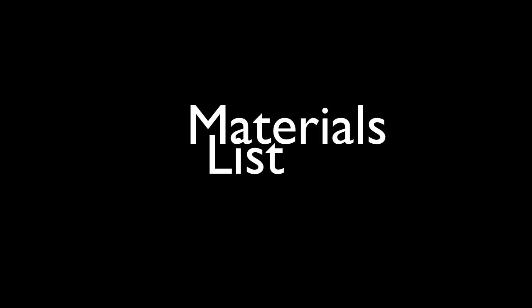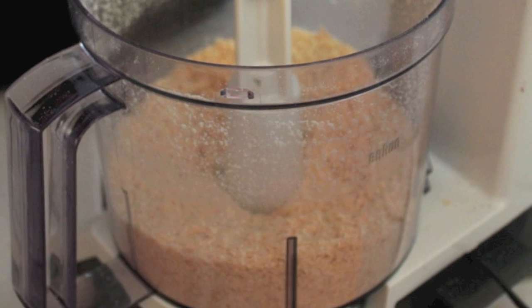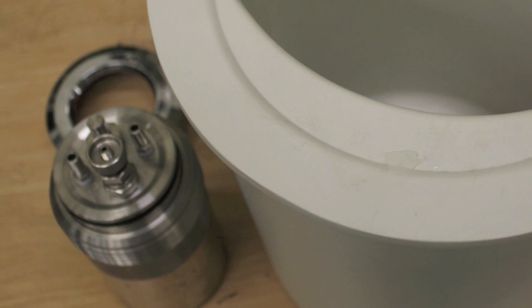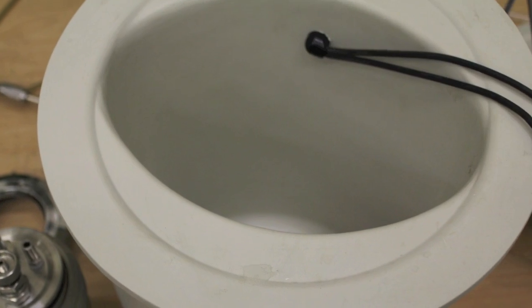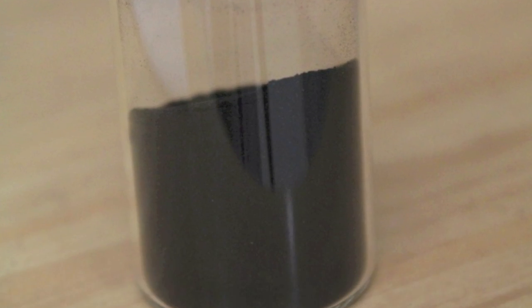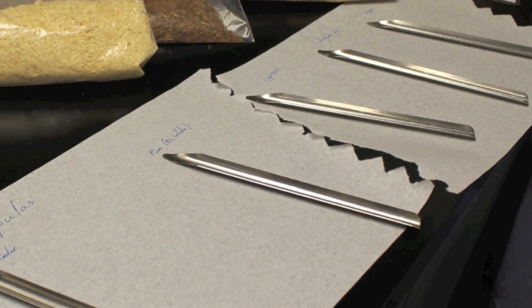Now let's take a look at our materials list. First we have a food processor, then wood shavings of five different tree species. Here is the oxygen bomb and the calorimeter, our five powdered wood shaving species, subbituminous coal powder, and a scrupula for each species.